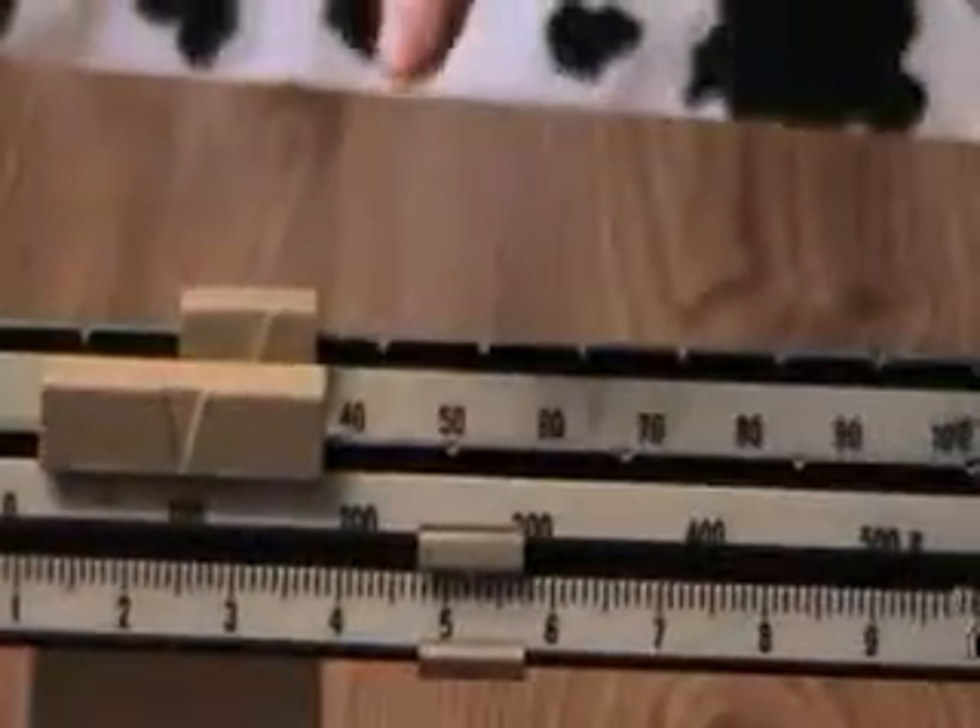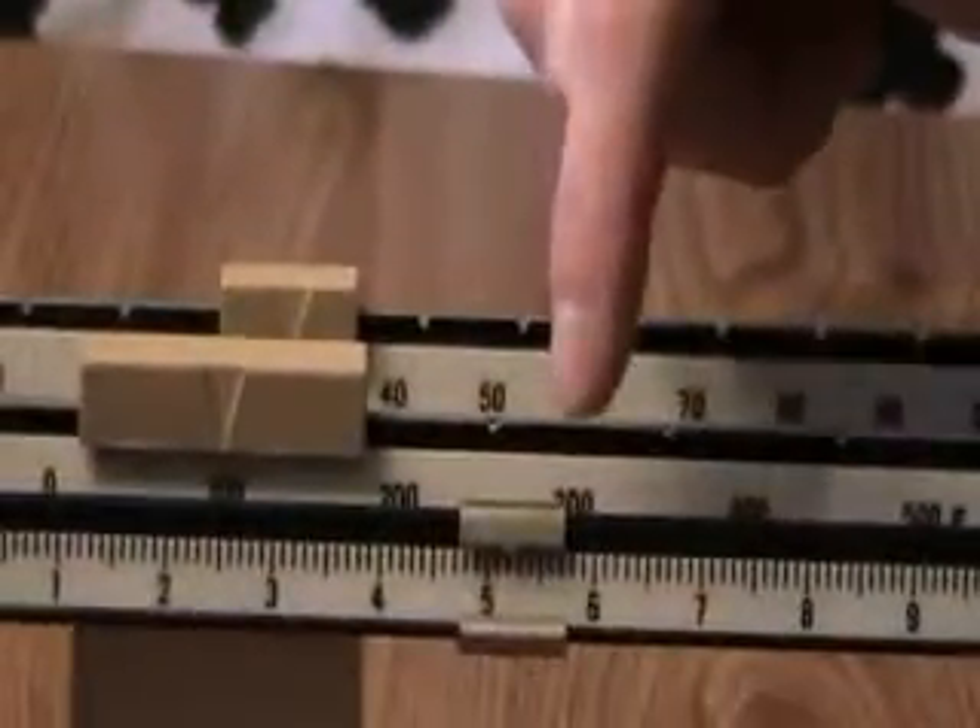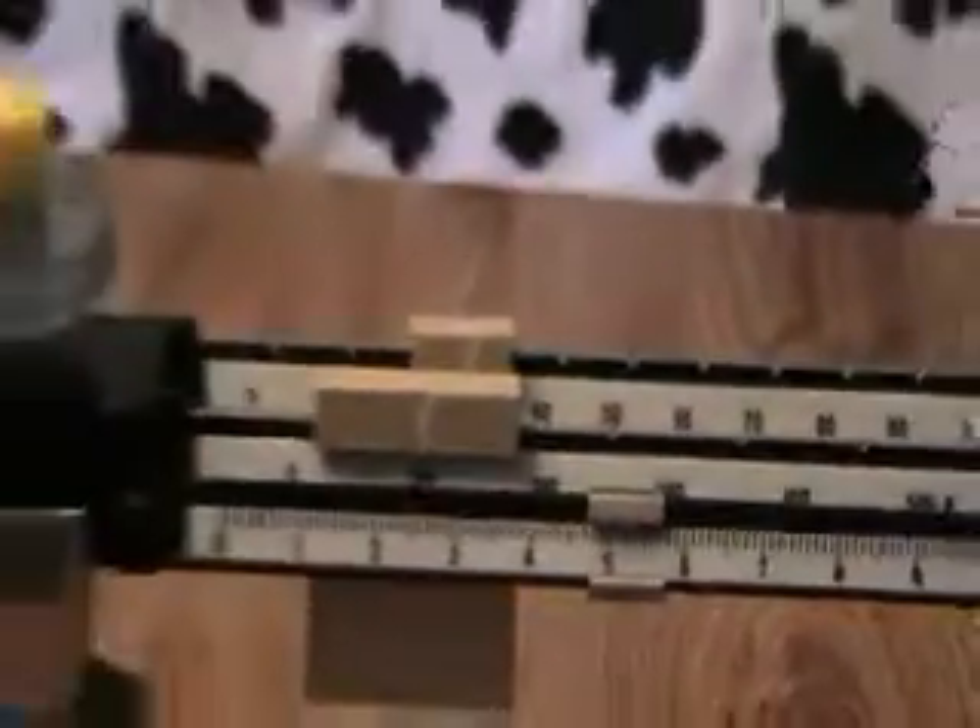I can't really tell — it looks like two. One thirty-five point two grams is the weight of our object. And that is how we use the triple beam balance.